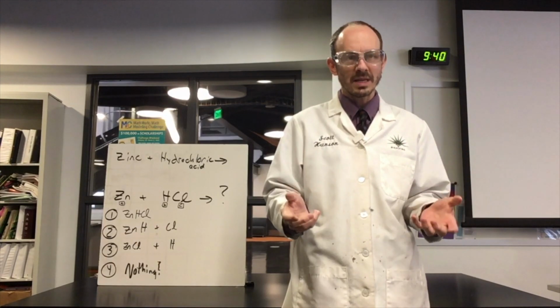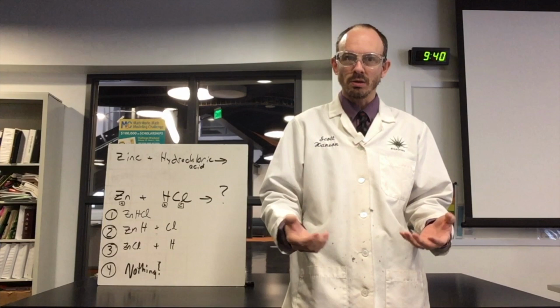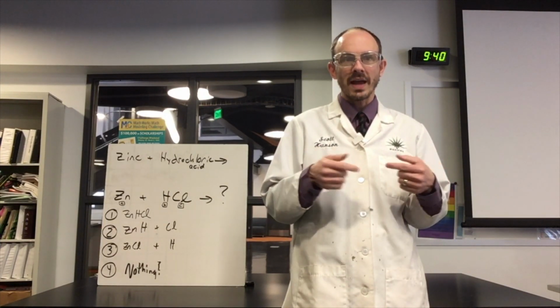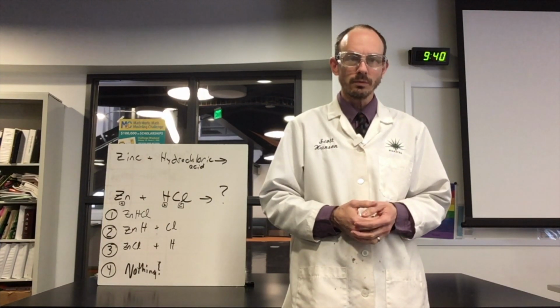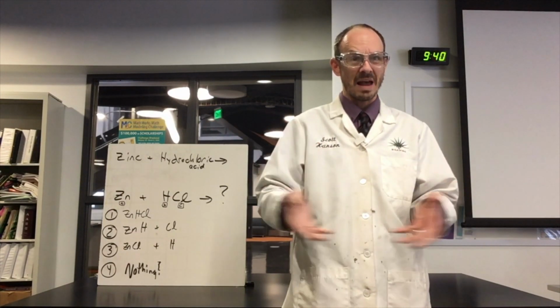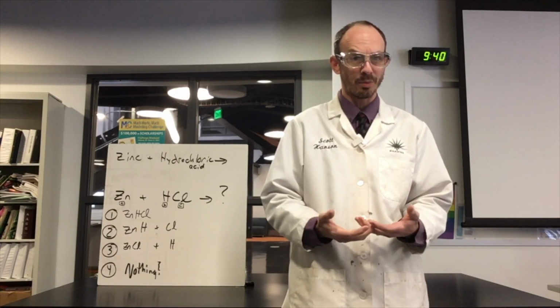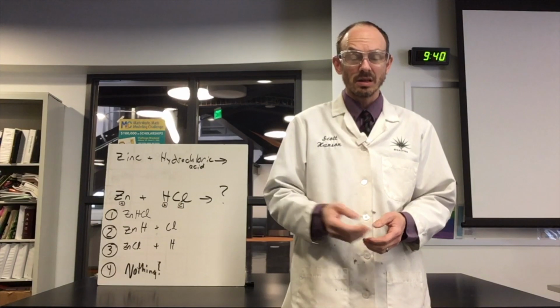But part of being a good scientist, and this year is, even if you don't get to do the labs, it's teaching you that everything is recoverable. So we need to know the mass of the material that is in the fume hood that's going to start evaporating or boiling away the liquid so that all we have left is a solid product. But we need that mass.